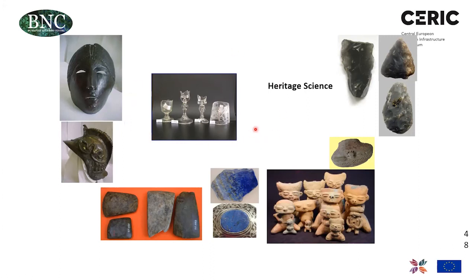You can measure very well glass kind of matrices. Here we can nicely differentiate between old-fashioned glasses from medieval and more modern glasses based on the boron content, because boron was later added to the glass melt to make the glass shiny and nicely looking.